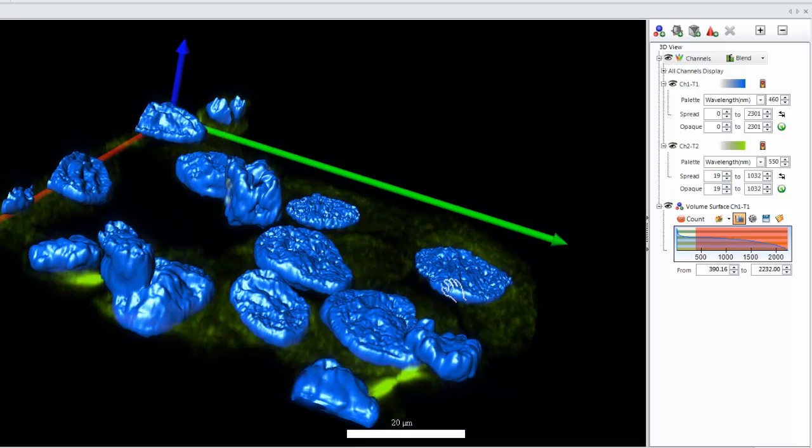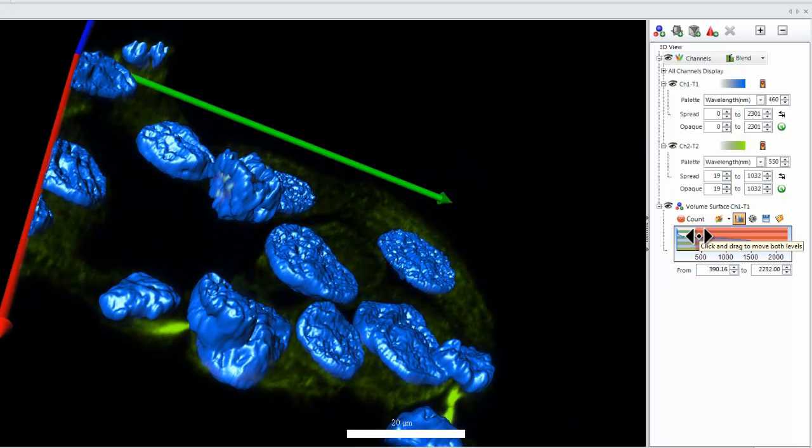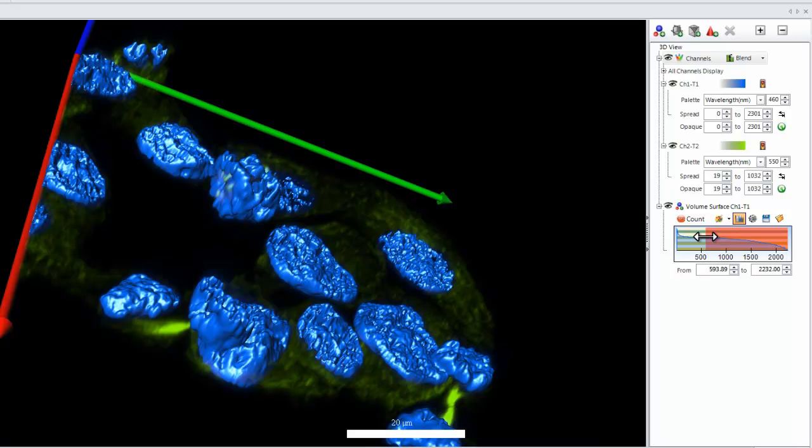The isosurface generated is based on the auto bright selection. This is the red selection on your histogram. You can always adjust the selection, which will also simultaneously adjust the view on your 3D image. Since reproducing an isosurface can be very important, the values are listed below, and a Save and Load button are available to keep isosurface settings along with an image set.